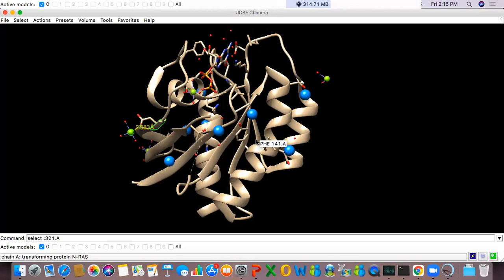The way you find that a ligand is interacting with a protein is that you take every single atom of the protein and then find its distance to that particular ligand atom. If the ligand has one atom, you find the distance with that one ligand atom. If it has 10, you find the distance with all 10 ligand atoms. This is the atomic contact criteria, used to determine whether a ligand and protein are interacting or not.